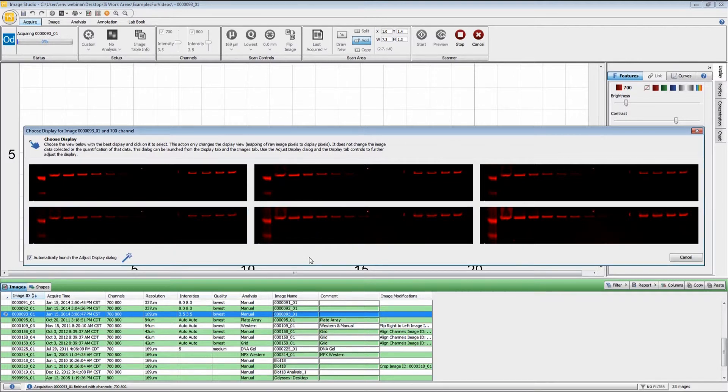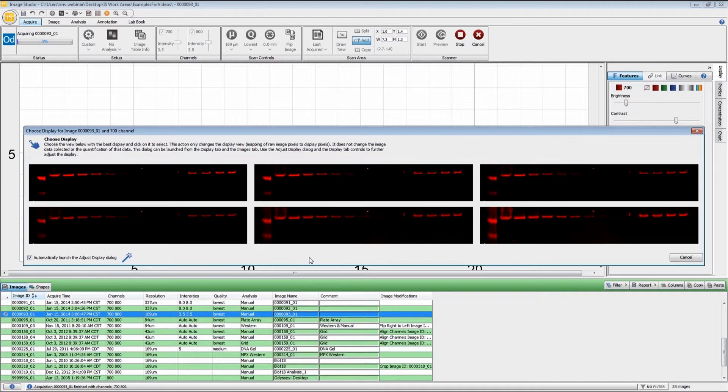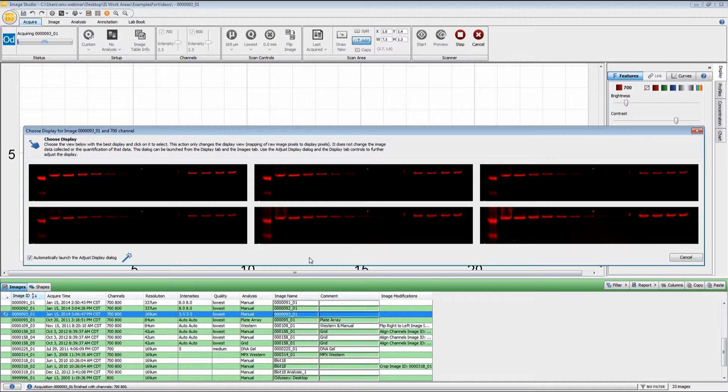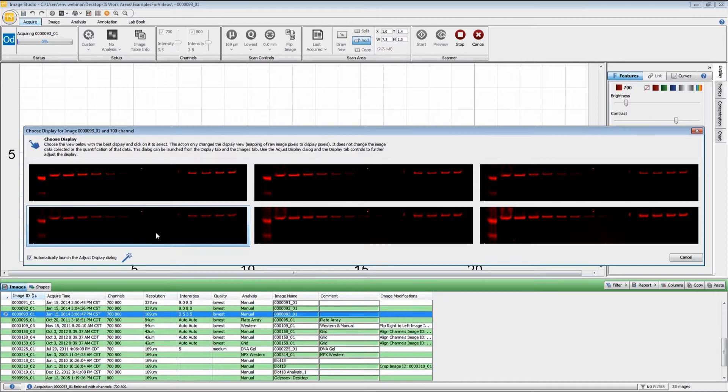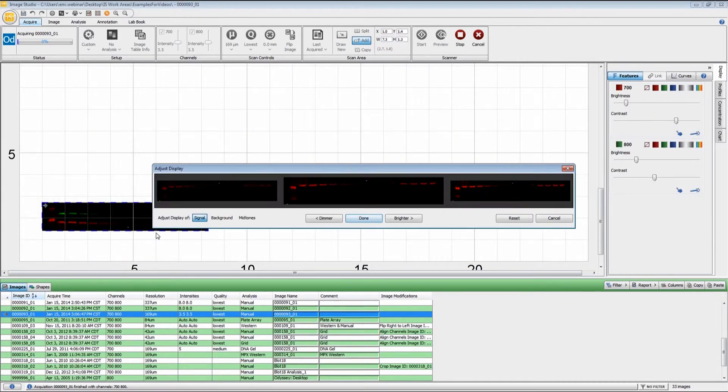Once the scan has completed, we do see these series of pop-up windows. These six images that you see right here are different automatic adjustments to the image. As I said, this has no effect whatsoever on the quantification. It is simply changing the screen presentation of the image. You just look through the six images and pick the one that looks the best to you.